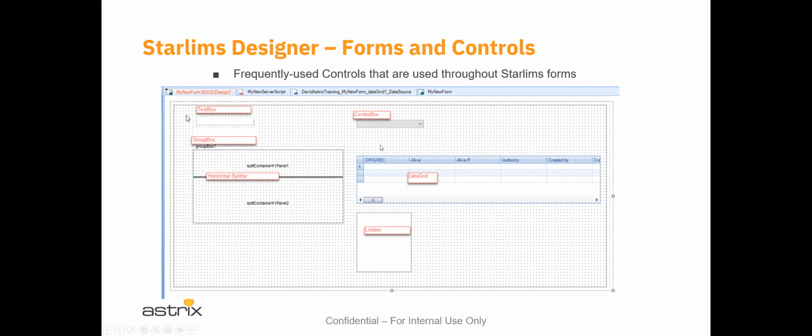Another example, similar to a combo box, is a list box. And a list box always appears in the size that you've formatted it in. For example, this one, I made a little rectangle out of it. And that might be the necessity for a given UI that you've designed. In other instances, it might be that you don't have enough room for a list box, and you opt to use a combo box, thereby dropping the combo box contents by hitting this button. Whereas this one appears with the list populated at all times.